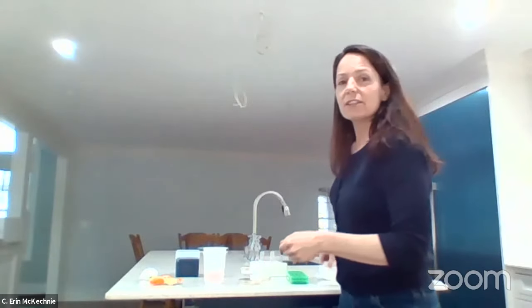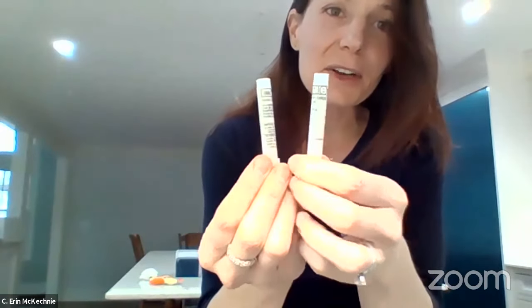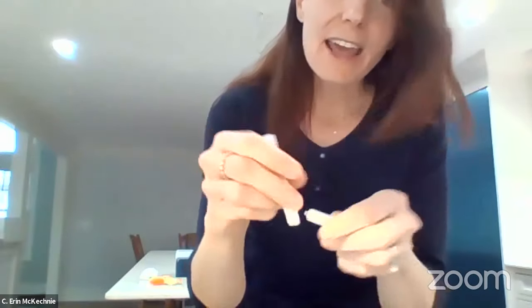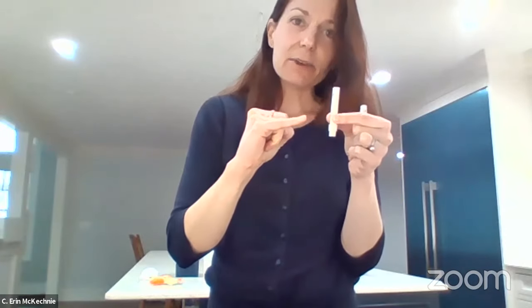There are different ways that you can apply the antibiotic. We happen to buy these little dispensers, okay? There is so much writing on these, they're very hard to actually read, especially from a distance like that. But this one, let me read it for you. This one happens to be kanamycin, and this one happens to be ampicillin. And if you look inside this little tube, there are so many little pieces of paper stacked on top of each other, and they have all been soaked in the antibiotic. If you've ever used a hole punch and you've seen that little circle fall out after you do it, that's exactly what they look like.